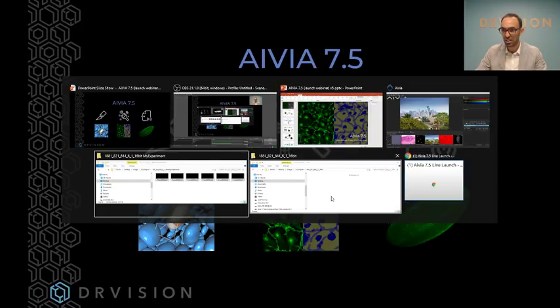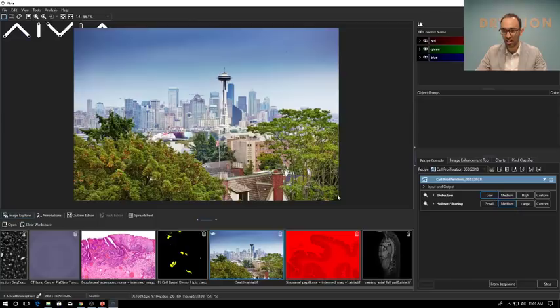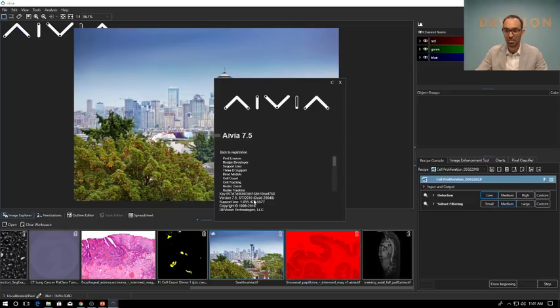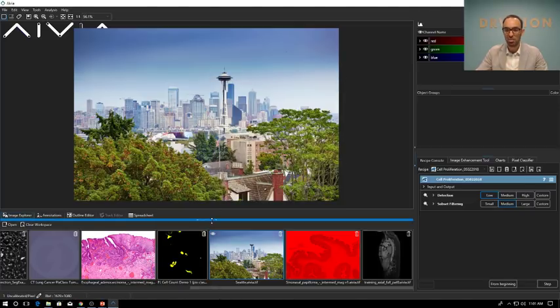Where is it? Here, yep, here it is. All right, so this is a live demo of Aivia 7.5. You can see Aivia 7.5. This is from yesterday, and that will very likely be the build that you will also be using.